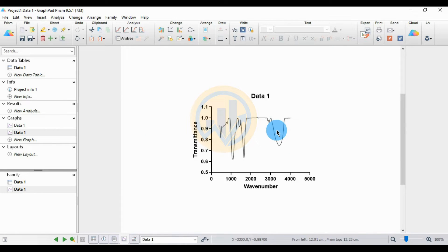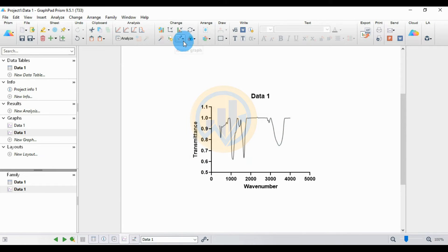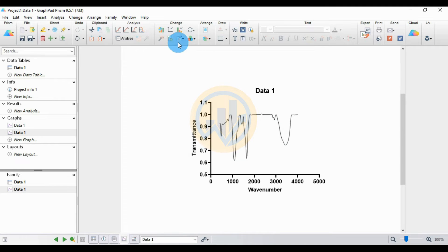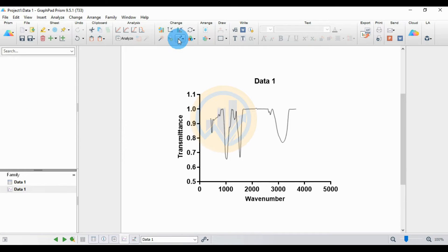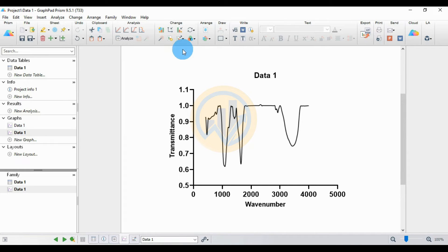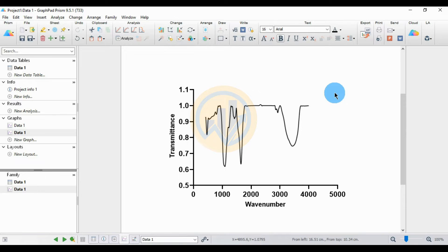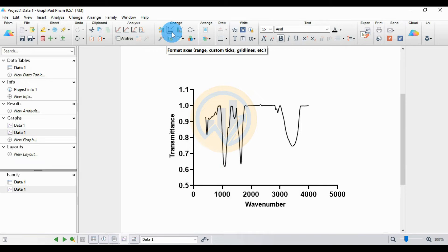The FTIR graph is now created in GraphPad Prism. Now we will customize the FTIR graph. Increase the view size and resize the graph to large. Next, we will edit the axis title and format the X-axis range.